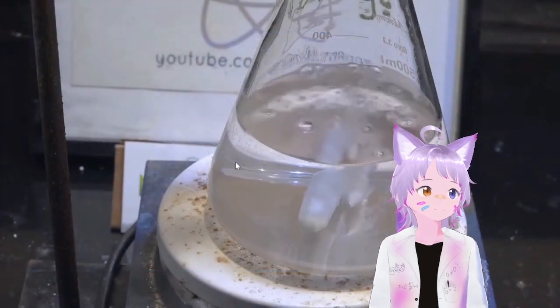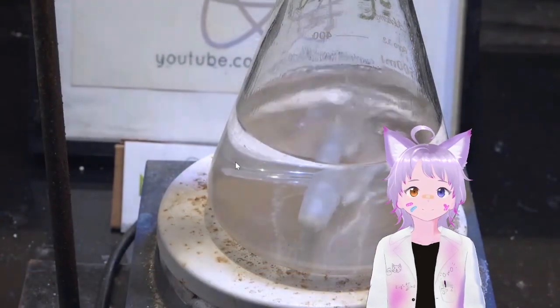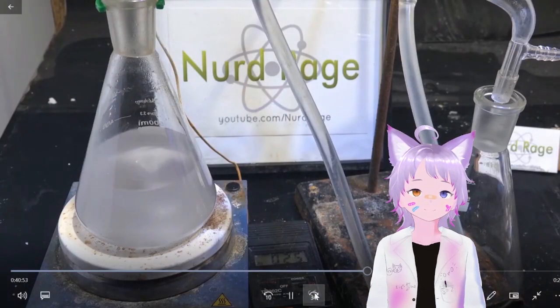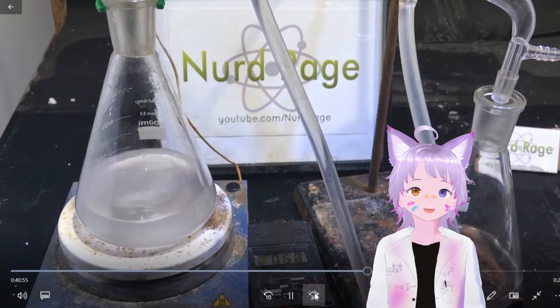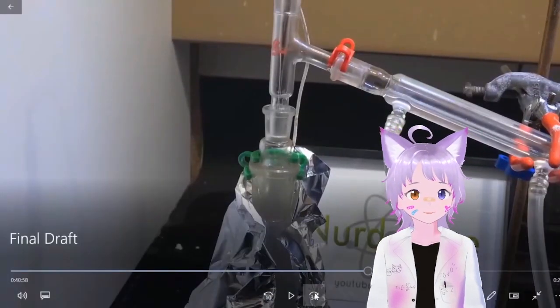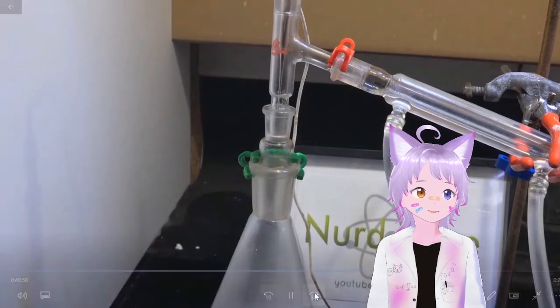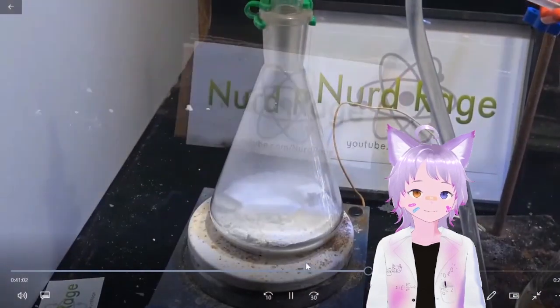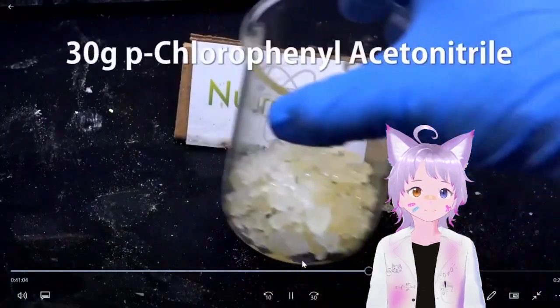Play-Doh. Drop them in with the cooling water turned on. Don't drop in too much at once or the... I'll just skip ahead a bit. So he just distills off the excess and gets the solid sodium methoxide. Makes sense. How dinky his setup is. It's kind of cute.